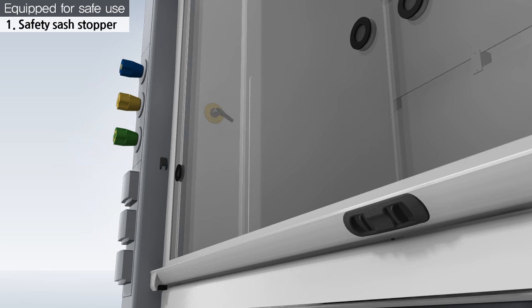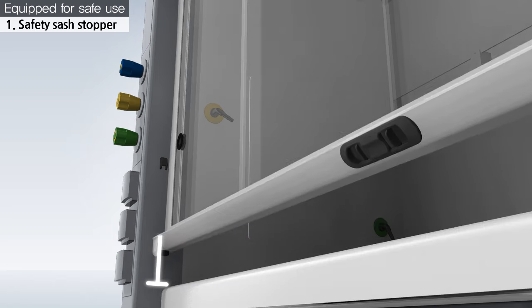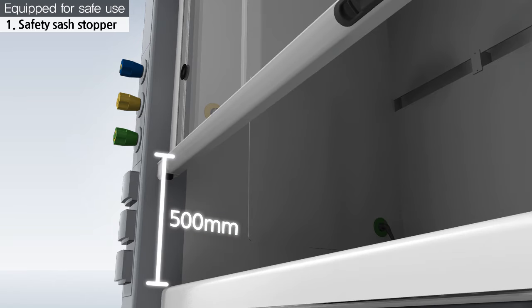Based on test results, the recommended height of a sash door opening is 500 millimeters, not to exceed 600 millimeters.